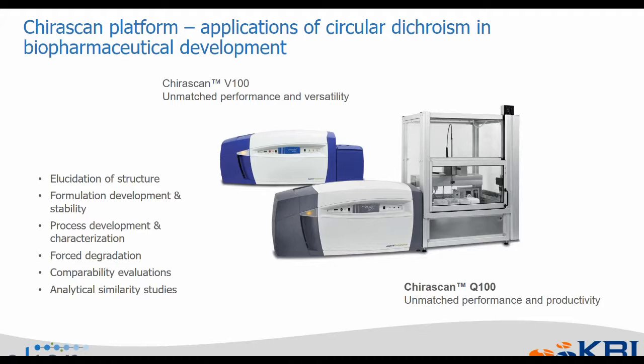And for forced degradation purposes, CD is a very useful tool to demonstrate both the degradation products that are formed, as well as the degradation rates during forced degradation studies. In this webinar, I'll be focusing on the last two listed here, comparability evaluations and analytical similarity studies, where the goal of such studies is to demonstrate likeness between spectra of one material to another.